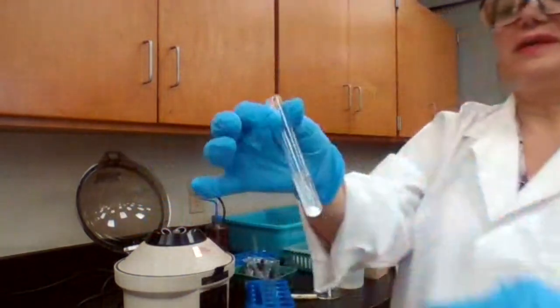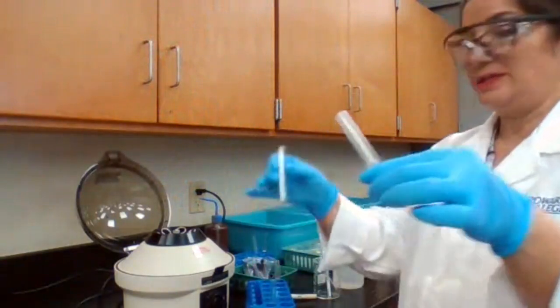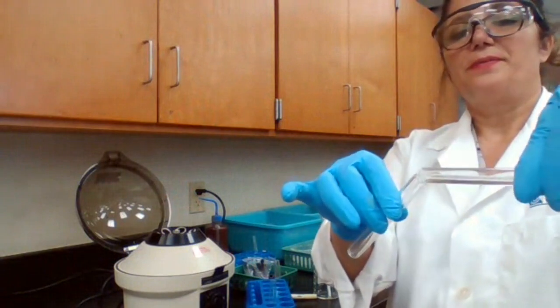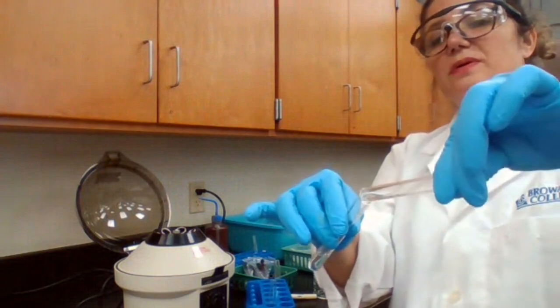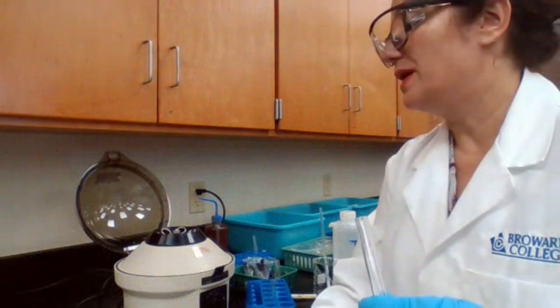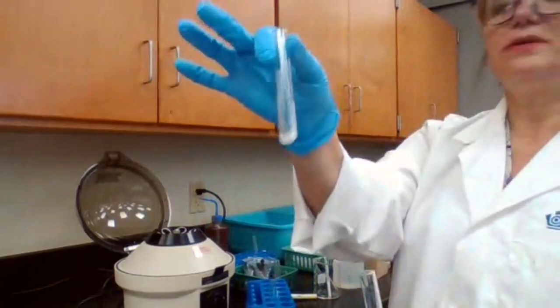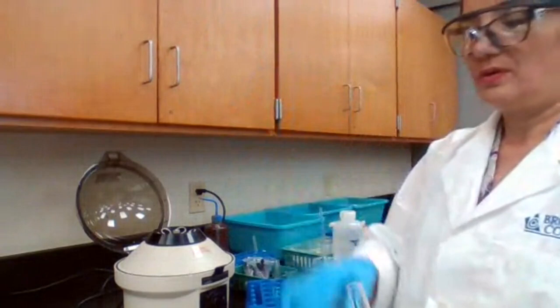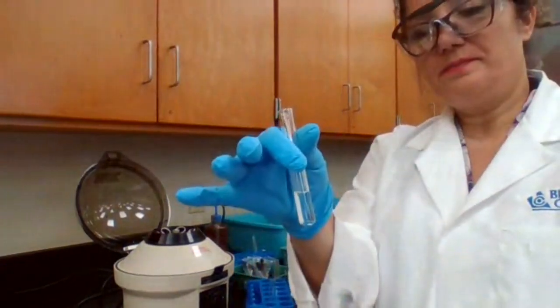Okay, I have the clear solution and a precipitate. I only need the top clear solution for my next step. This step is basically 1D1 and 1D2. So this is the 1D2. The precipitate, I don't need it. It needs to be discarded, so I'm putting it on the discard test tube rack. Now we are in part E1.